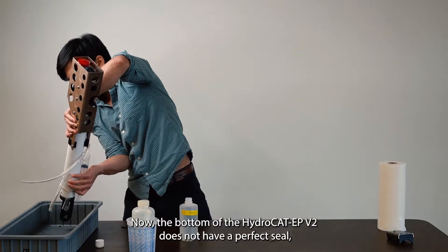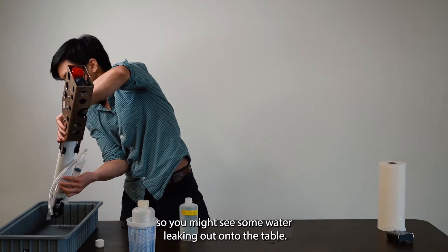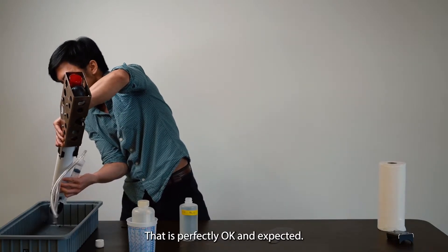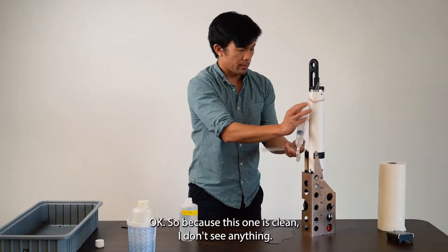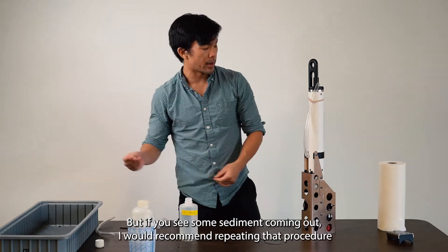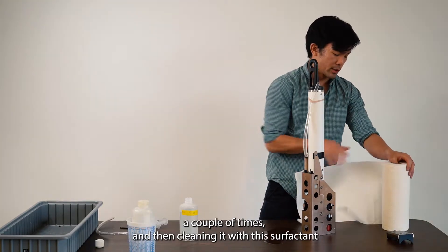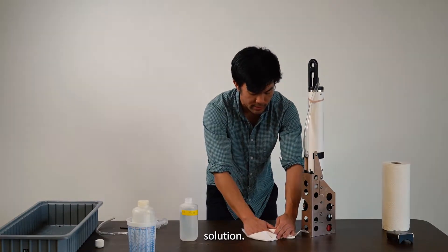Note that the bottom of the HydroCat does not have a perfect seal, so you might see some water leaking out on the table — that is perfectly okay and expected. Because this one is clean, I don't see anything. But if you see some sediment coming out, I would recommend repeating that procedure a couple of times, and then cleaning it with the surfactant solution.